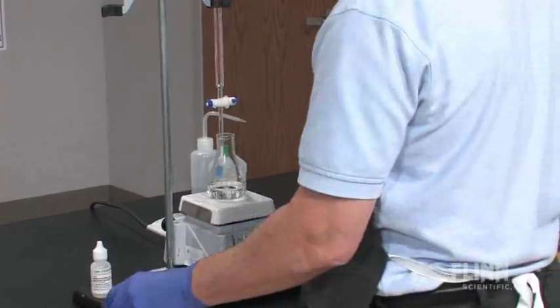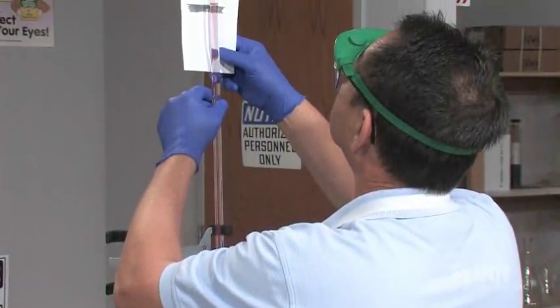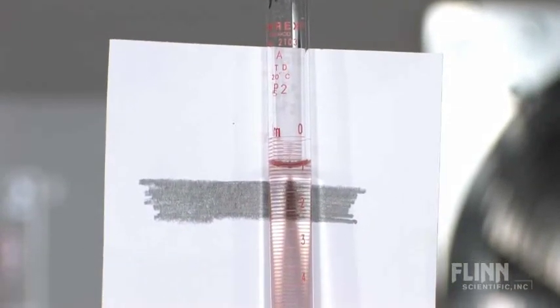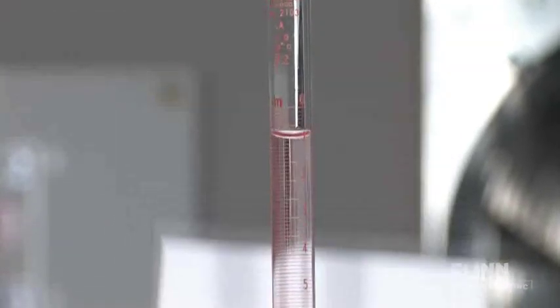Once a burette has been properly filled with the titrant, determine the initial volume. Place the index card marked with the solid line behind and underneath the level of the liquid. This will highlight the meniscus, making it easier to read.